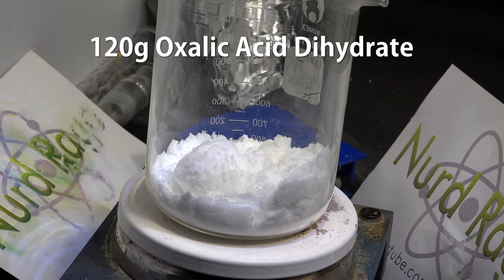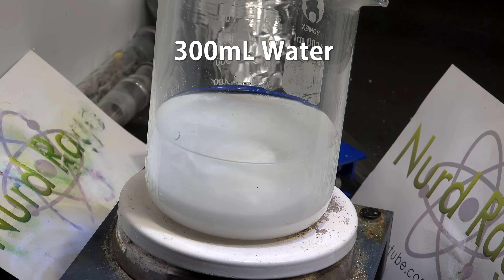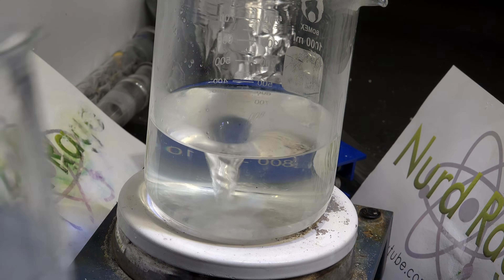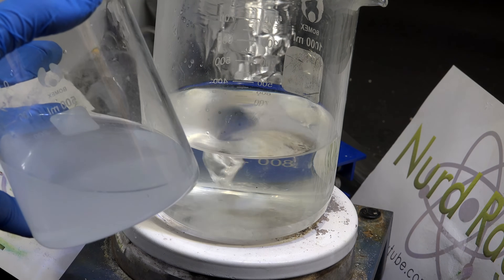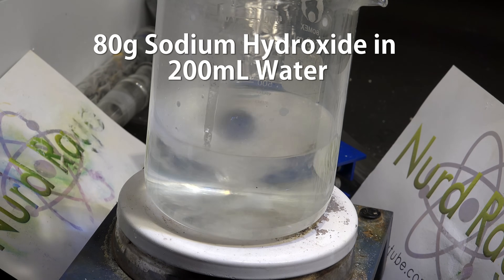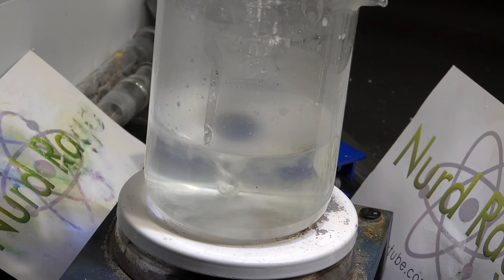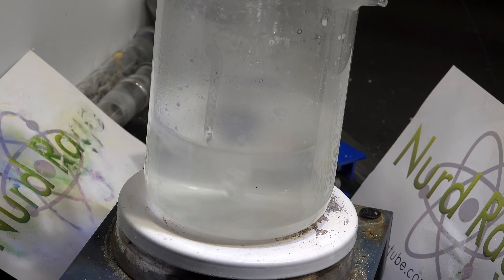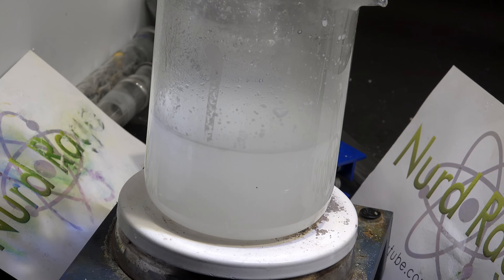First we start with 120g of oxalic acid dihydrate. To this we add 300mL of water. Stir and heat the mixture until completely dissolved. Oxalic acid has dramatically improved solubility at higher temperatures, which is why we have to heat it up. Once it's completely dissolved, we slowly add a solution consisting of 80g of sodium hydroxide in 200mL of water. Be careful as the solution will boil since it's already very hot. The reaction of an acid and base tends to generate even more heat. You can substitute equimolar sodium bicarbonate, but the bubbling from the carbon dioxide makes this even harder to control, so I'm using sodium hydroxide.